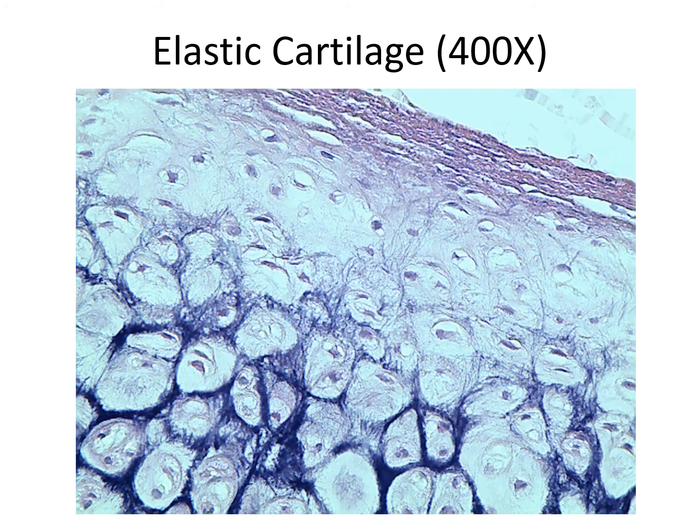This is elastic cartilage, and in elastic cartilage you will see lots of these dark fibers. These are elastic fibers, that's all the dark stuff here. And we do have these chondrocytes inside the lacuna. Here's another lacuna with chondrocytes, and this covering over here, perichondrium again. So elastic cartilage looks pretty dark.